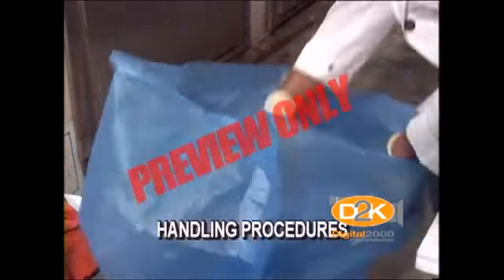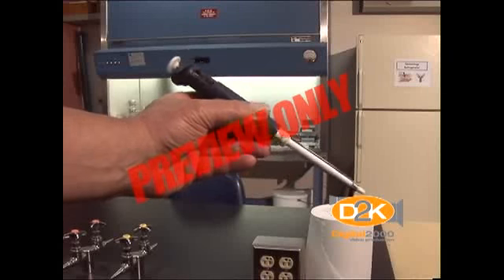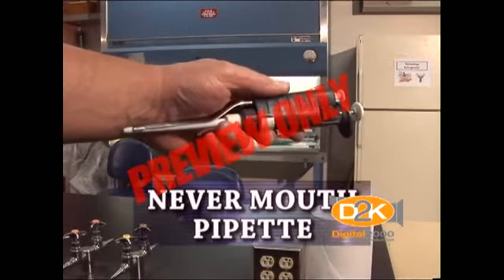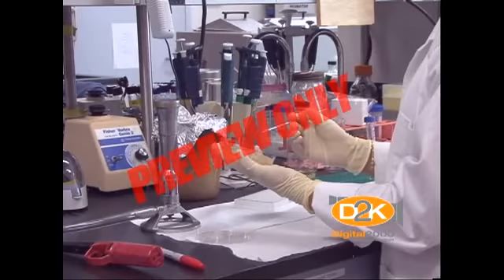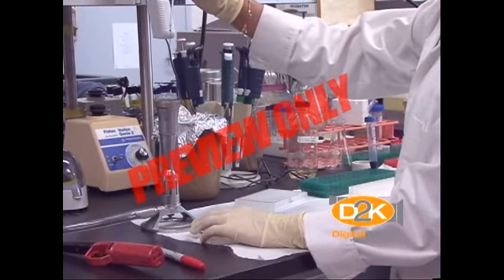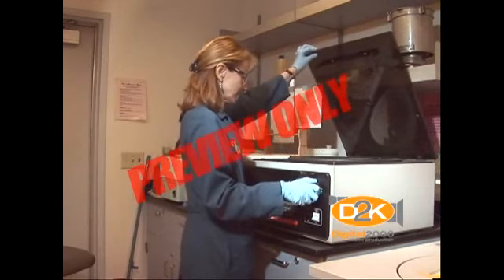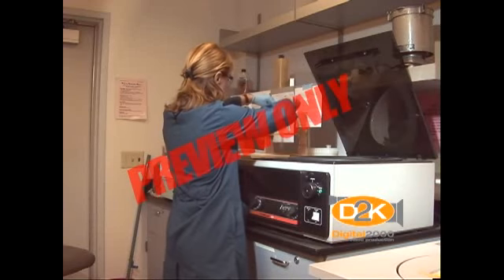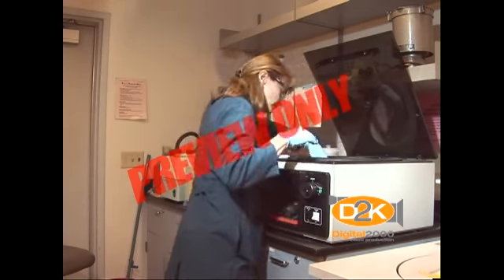Now we will discuss some important aspects of safe handling procedures. First, you should always use a mechanical pipetting device. Never mouth pipette. Direct ingestion will likely occur as a result of this outdated and dangerous practice. Aerosol production should be minimized by heat sealing or using the caps on tubes during centrifugation. Remember, when bench-type centrifuges are used in a biological safety cabinet, the centrifuge operation can create air currents that may cause the escape of a biological agent from an open cabinet.